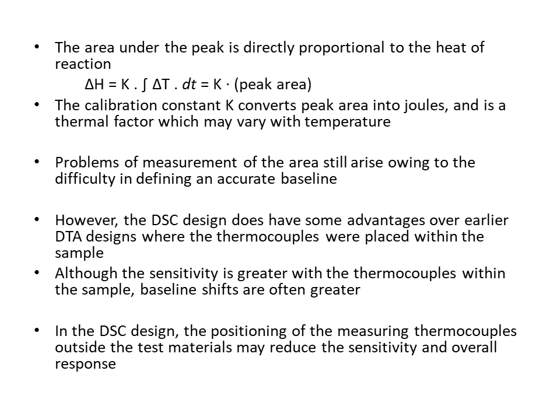But another problem with DTA curves was that the baseline shift also became greater. This problem becomes quite a lot less in the case of DSC design. In the DSC design, the positioning of the measuring thermocouples outside the test material may reduce the sensitivity and overall response of the technique.